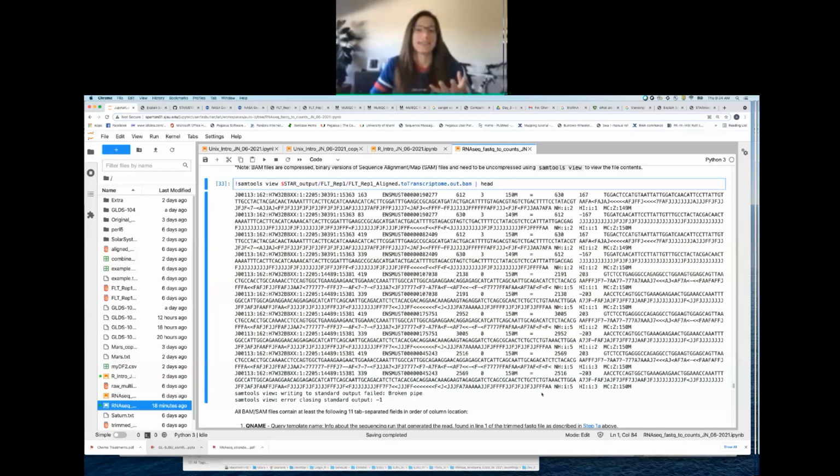which will represent the next mapping of the next 4 reads. So read pairs usually come after each other because we sorted this. It's another reason why we sort. It's because a lot of tools want to see the mate pairs coming right after each other in the BAM file. So one way to do that is by sorting them. So that's why we add that option here. And so I bet if we add an extra 4 lines to this head function here, that we'll see that same mate pair, and we could see the other 2 transcripts that it's mapped to.